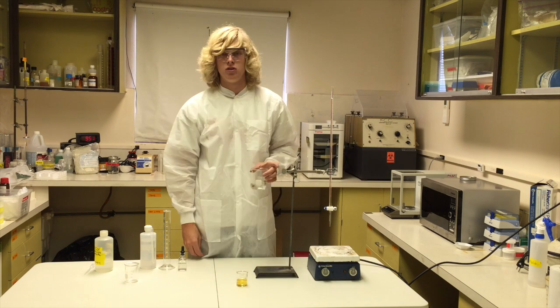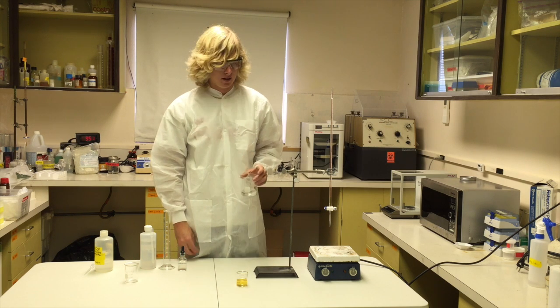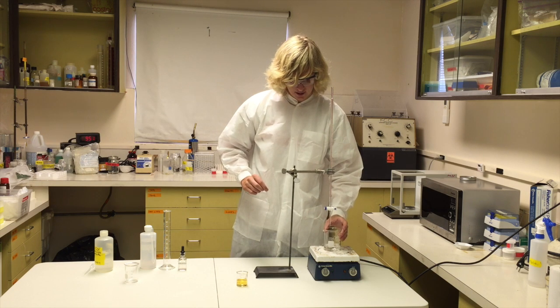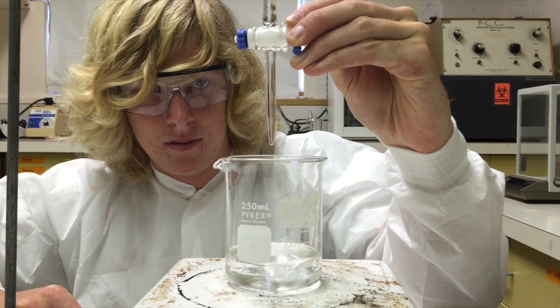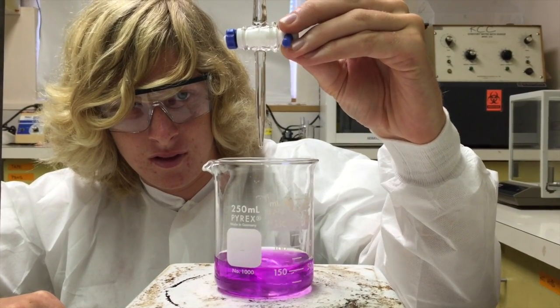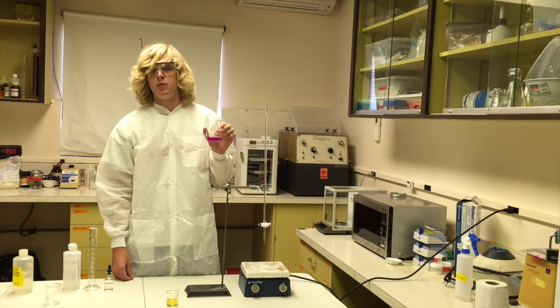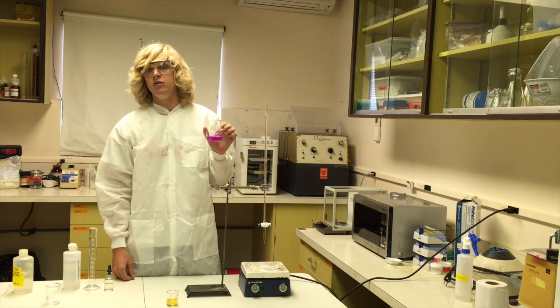Now we're going to add some solution into the isopropyl alcohol until it turns to a pink color. So we'll put the stir bar in our solution and go ahead and set it on the stir plate. We're just going to put 1 drop in and see if it changes color. Since the first drop of potassium hydroxide turned the solution a bright magenta color, we will record the B value in our tables as 0 for our calculations.